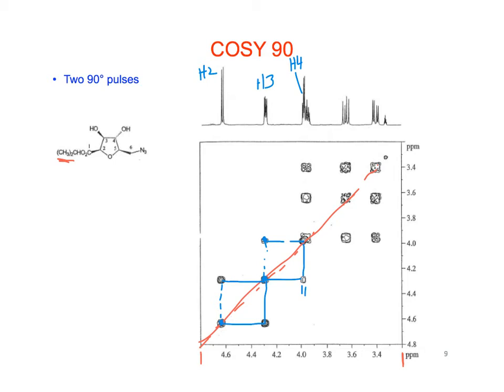Now the tricky part here is it's hard for us to see what H4 is actually coupled to, because if it was just skinny like that, we don't see any other skinny signals that are coupled to that. So we could start here on the other side. What do you think about these 2 signals? We stop going in this direction now and then start on this side. Just gonna see if it can help us. Yeah, see if we can meet in the middle.